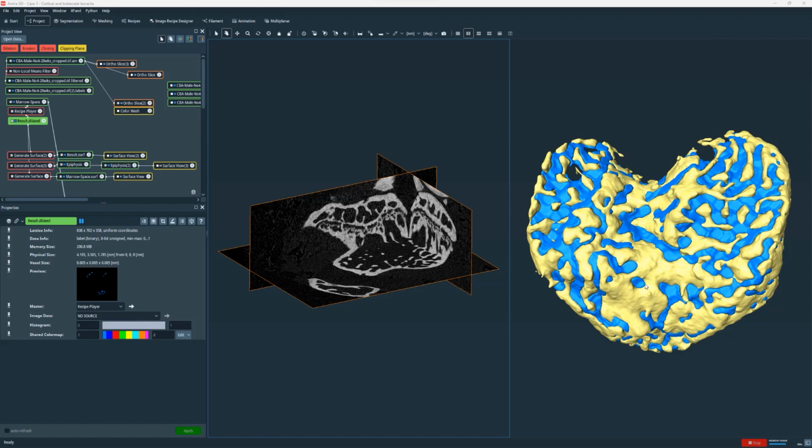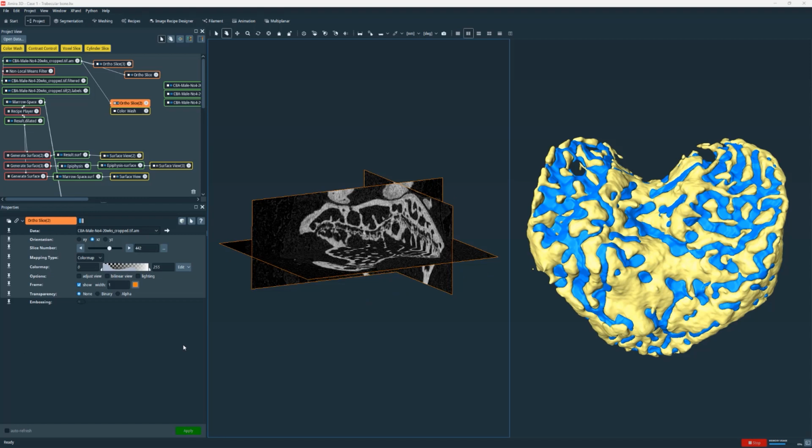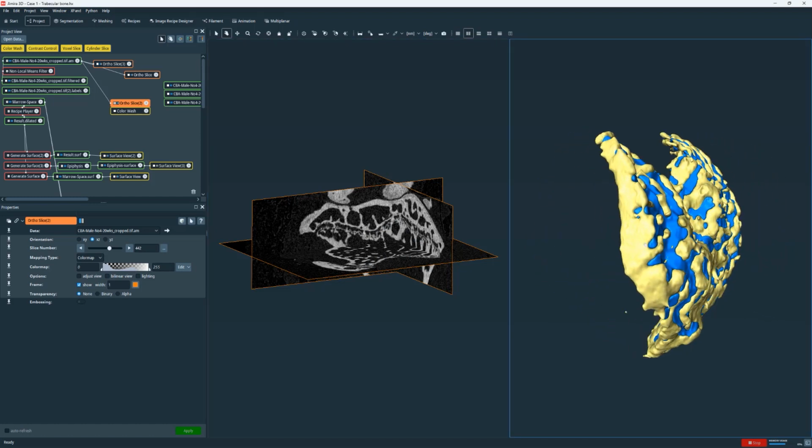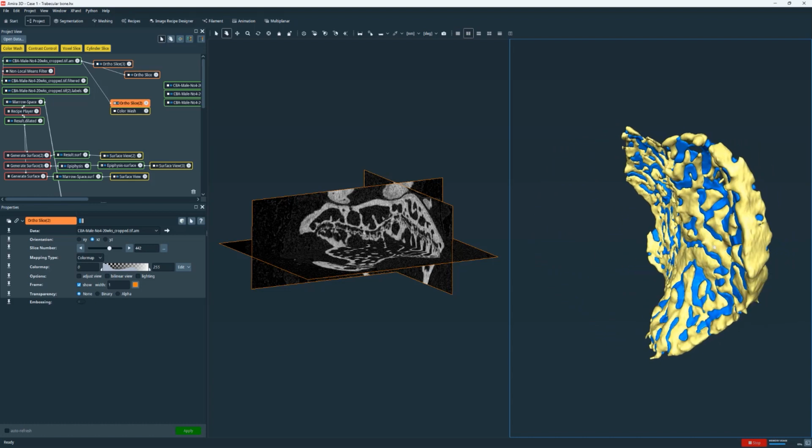So now I'm going to switch in Amira Software to show you more details about this project. Okay, so here we are in Amira Software, where we can observe the grayscale image of the murine tibial bone, and specifically we can observe the epiphysis region and the metaphysis region. And then there is a 3D reconstruction of the trabecular and marrow space, which correspond to the epiphysis region.